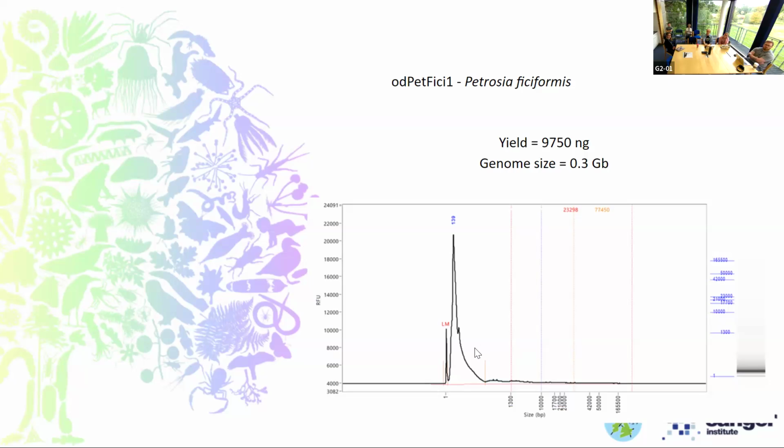So something that we would consider doing, because we have a really high amount of DNA, is using a product that PacBio produces called a short read eliminator. So this is a buffer that you can add to your DNA that will get rid of all of this short molecular weight DNA here, and then hopefully you'll be able to see if you've got any higher quality DNA to the right of this low molecular weight peak here. So something we can work with because of the high yield in the sample. We then do the QC again, send it through the Femto, and then reassess to see if there's any high molecular weight DNA that we can work with.